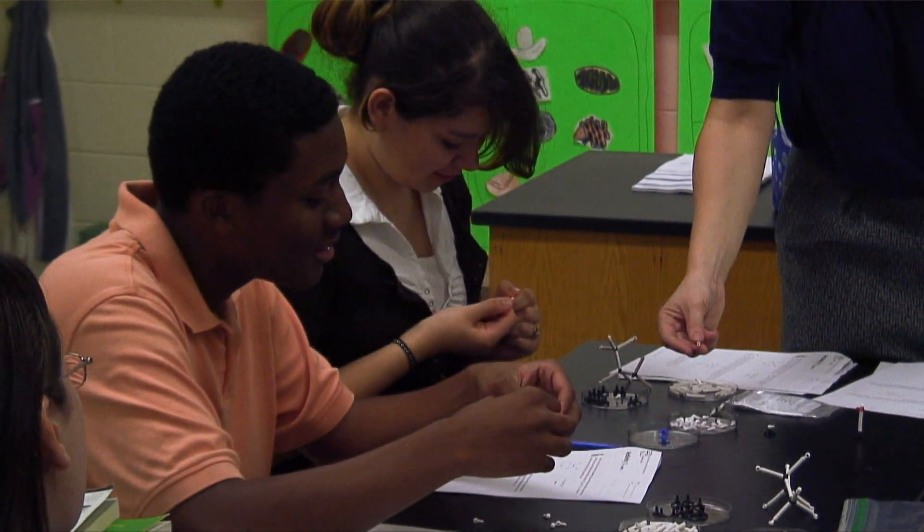The thing I like most about using the inquiry kits is that it really allows you to picture the molecule, because when you have it on paper it's hard to see what goes where and how everything's bonded together.